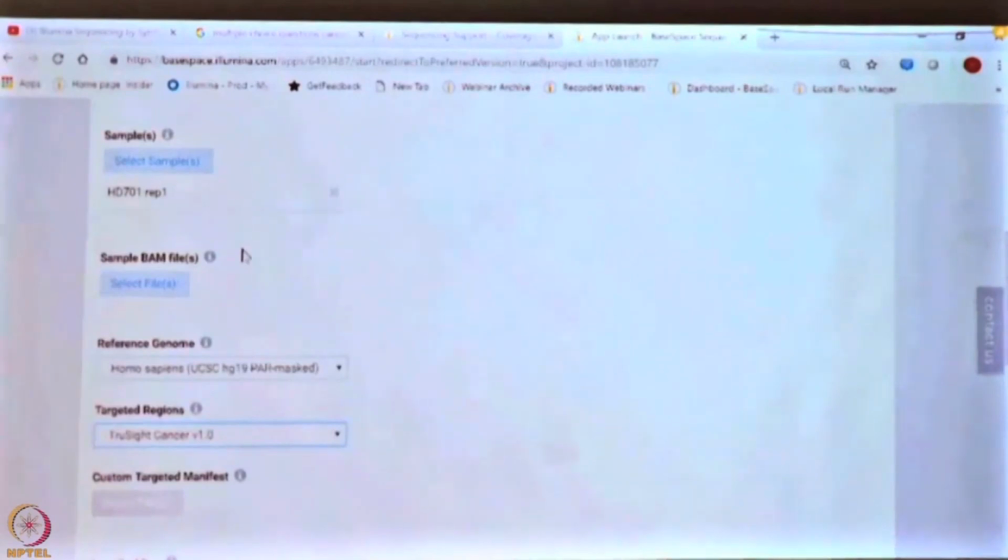Okay. And now, let us hope that it works. I am just going to check that I have actually done everything that I am supposed to. Okay, I think there are more things for us to do. One second.